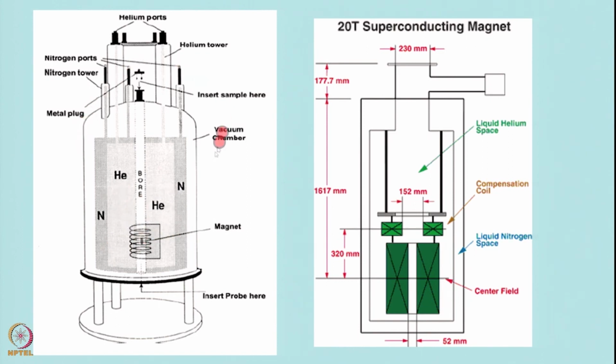And then of course you have all other kinds of accessories which are required to maintain all of these things, the coils and the evaporators and measurements and things like that. So, your sample remains, these are the dimensions, of course we do not need to go into those details. We have talked about the advantages of the Fourier transform and the FT-NMR spectrometer, how does it look.